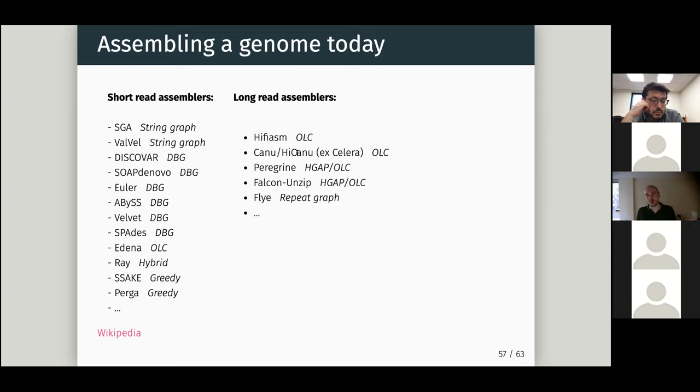It's HiCanu. Now there is also the version that assembles HiFi reads. Again, these two tools are competing with each other for the supremacy in the HiFi world. But again, it's just 2 years that we are in this situation. But there is still competition. I would say HiFiasm has been highly extensively tested in humans. But if you have a non-human species, I would say in many cases HiCanu is actually more accurate. Again, you need to have HiFi reads to assemble for this one.